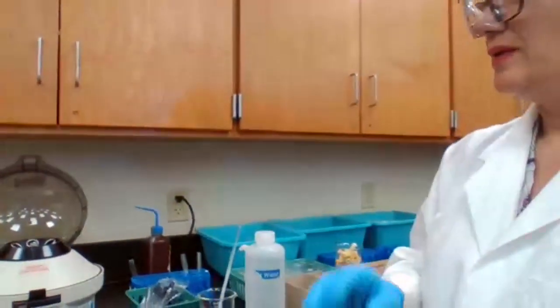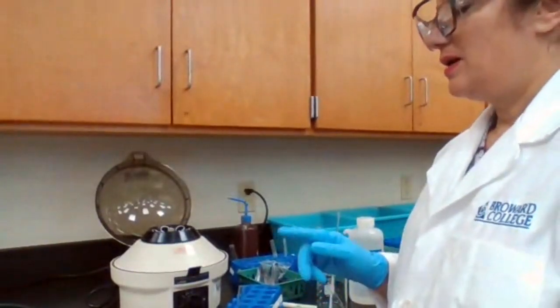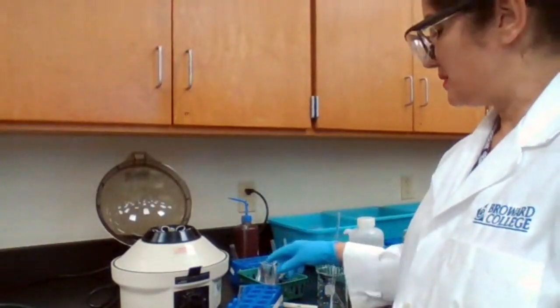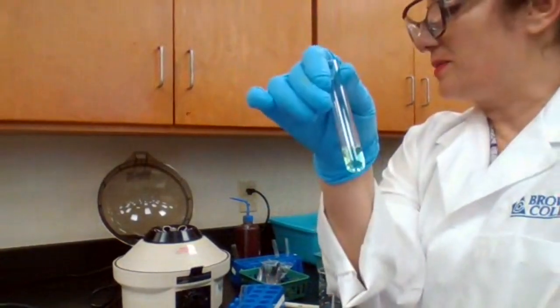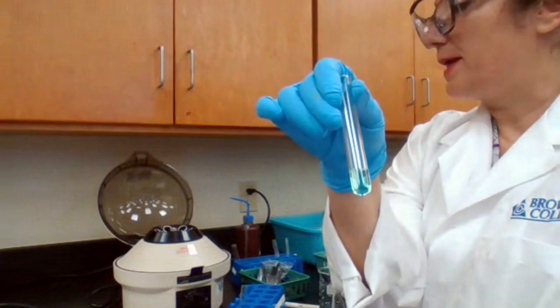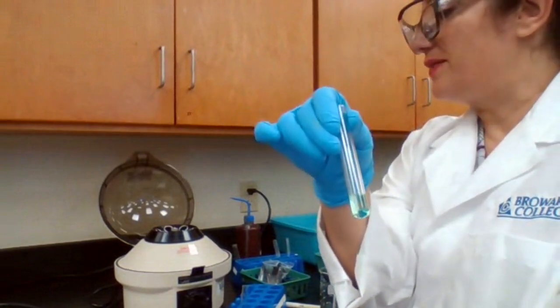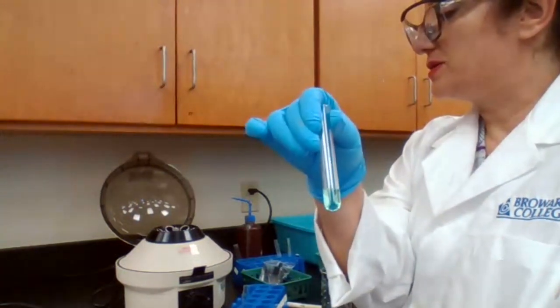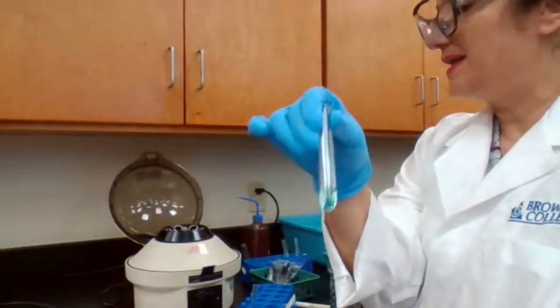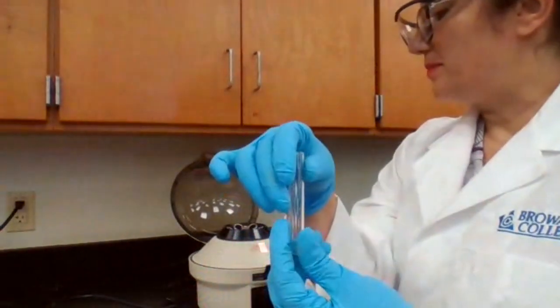Next, we have 2 more ions that we want to check. We are going to go with the supernatant that we had from part B. We don't know if there is any lead left.